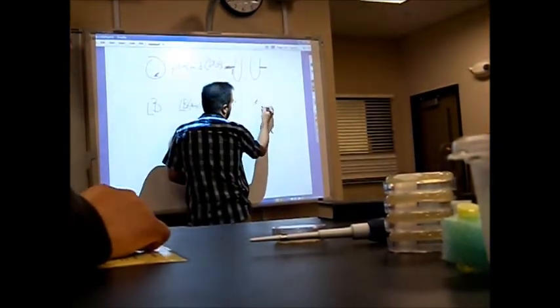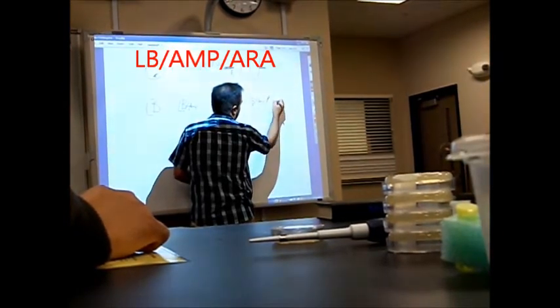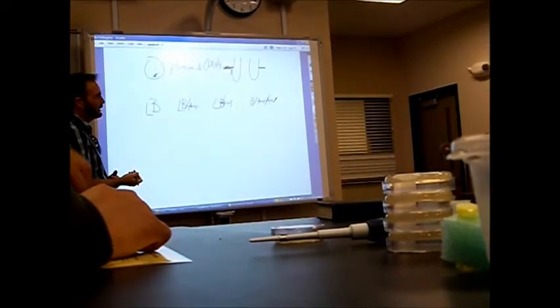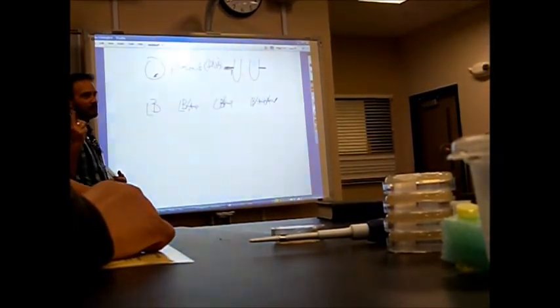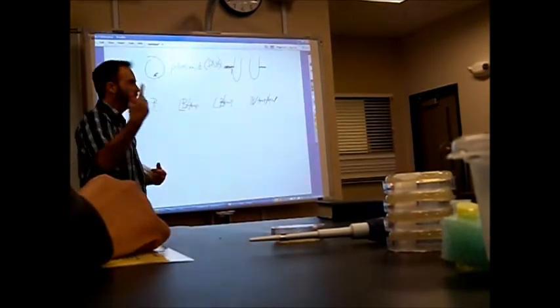And then you've got one that's got LB, it's got amp, and it's also got ara, which is for arabinose. What's arabinose again? It's got the sugar. What does the sugar do? It turns the switch on.